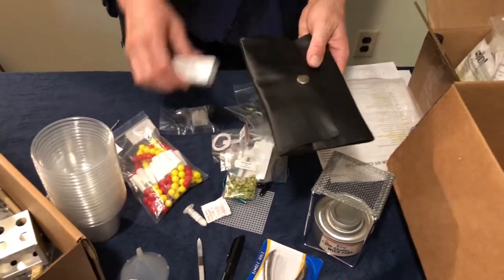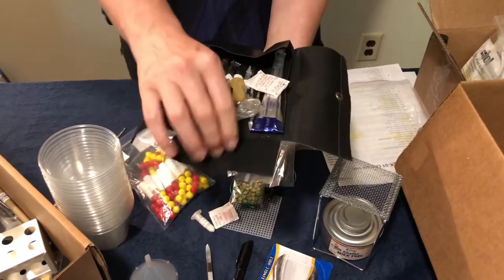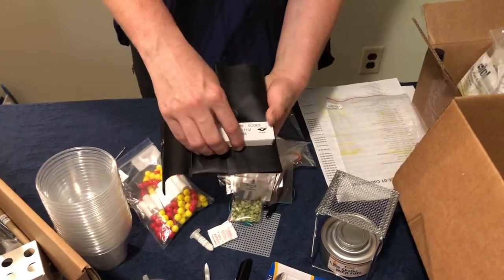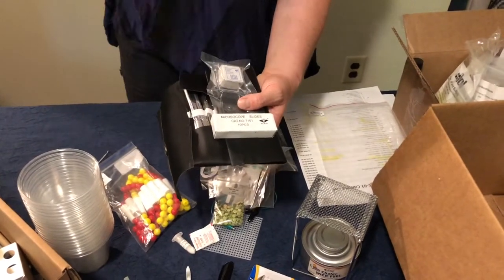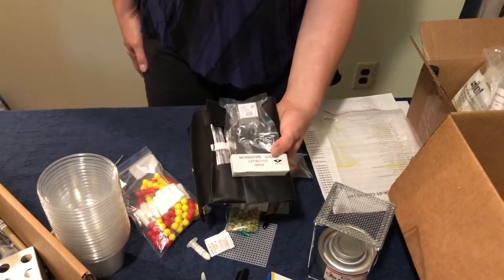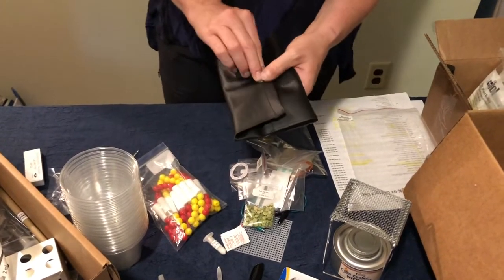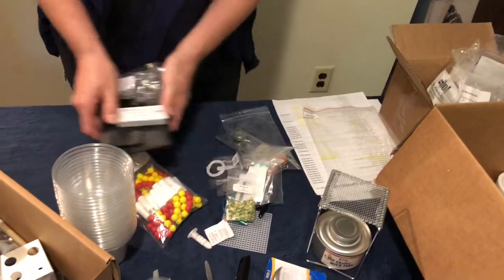One thing I did want to point out: my kit came with a dissection kit, but we're not going to be doing any dissection in our class. It also came with microscope slides and cover slips, but we're not using a real microscope — we're using the virtual microscope. So you'll have these supplies if your kit came with them; you'd just need to track down a microscope separately if you wanted to make your own samples. These are some of the items that may be included in your kit that you can set aside, as we will not be using them.